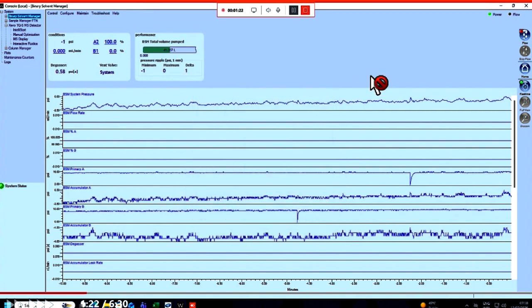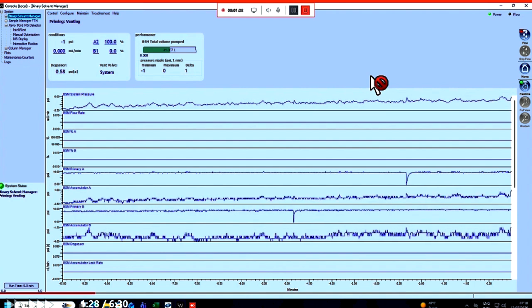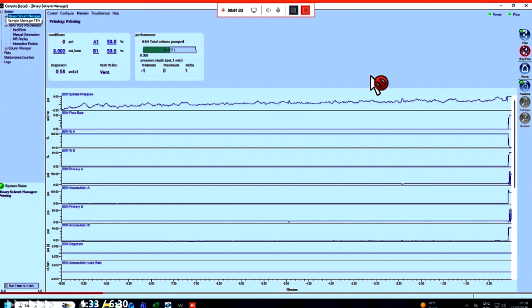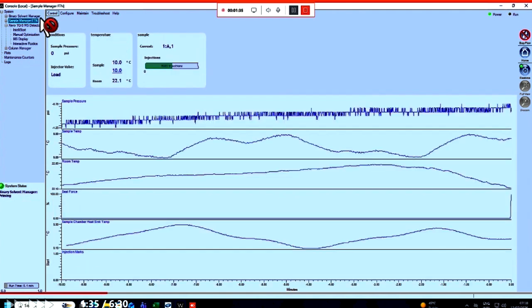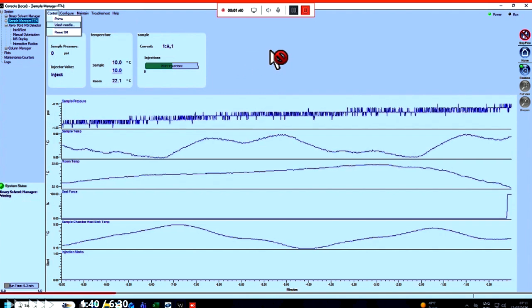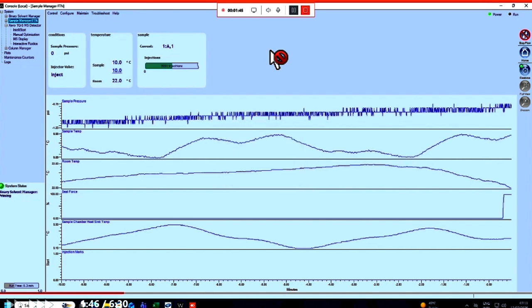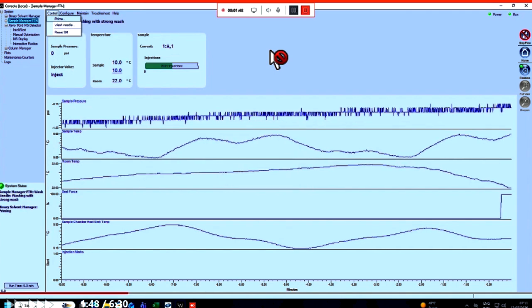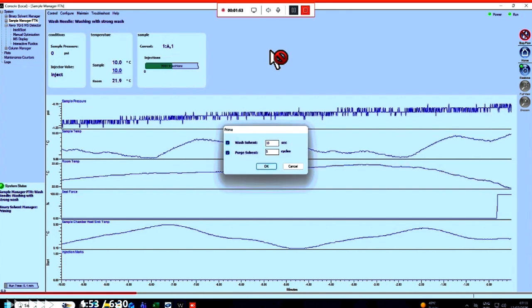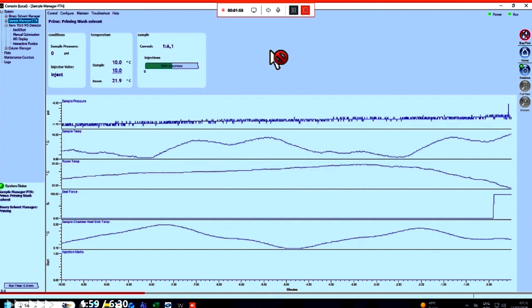And if you prepared the other bottles also, new bottles for column washing, the needle, whatever, you also need to purge these bottles A2, B2. And also go to the sample manager and wash the needle and prime the autosampler. Then during this time we will wait until the purge of the mobile phase is done. It's very important to be sure that there are no bubbles, so the pressure will not go down, and then we can start preparing our sequence.